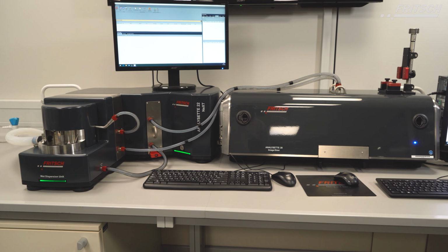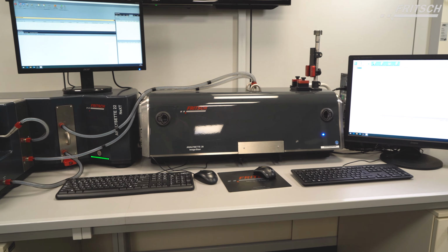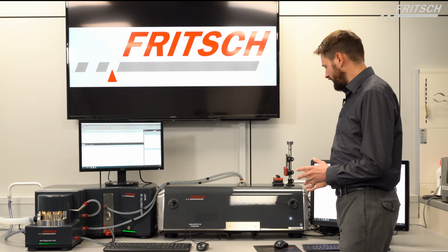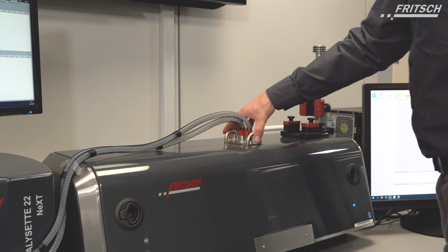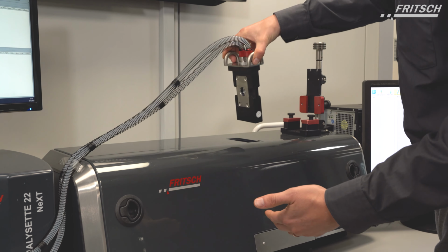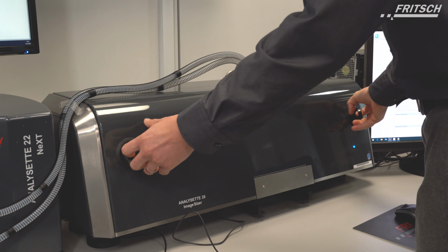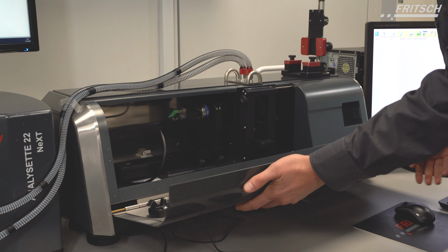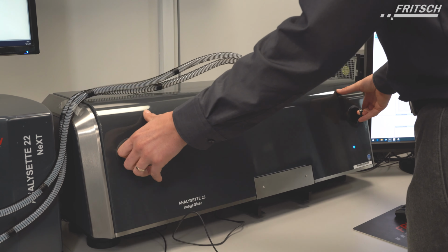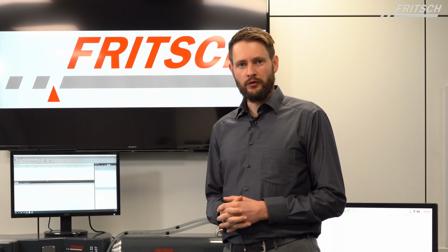If you would like to order the system the way it is set up now in our lab, what you need is the A22 including the wet dispersion unit and the A28 with the addition of the wet measuring cell and also the according objective for wet measurement. This way, both instruments will be delivered including their own computer.